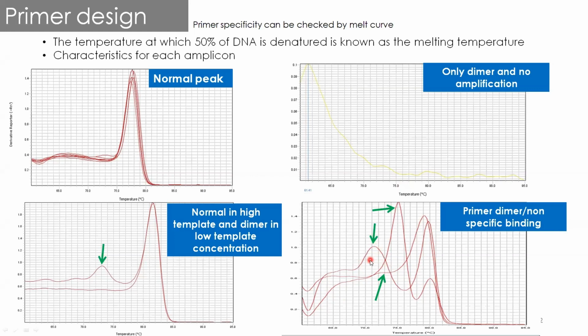What it reflects is that the primer does have specificity to the gene, but it is either forming a self dimer or a heterodimer. And in case the template is less, it is forming a loop or a self or heterodimer and contributing to the fluorescence. So all these aspects we need to check when we design a primer, right?